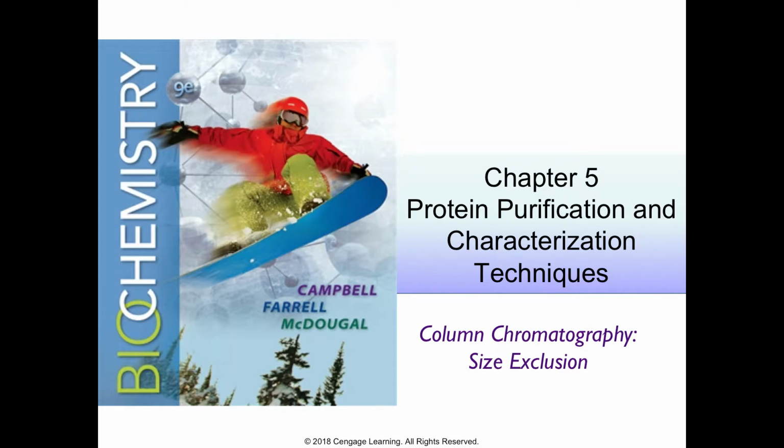In our last lesson, we looked at cellular extraction and an early step in protein purification, salt fractionation. Let's look at what might be the next step in our purification, size exclusion chromatography.